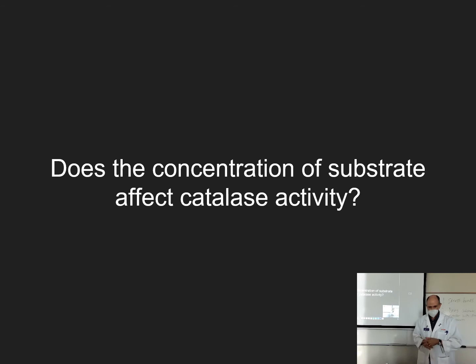So the question today is, does the concentration of substrate affect catalase activity? And to be even more specific, as I said earlier, there's a more specific question, and maybe I should just change this slide, but I haven't yet. A more specific question on the top of page 38. Well, actually, no. Actually, I lied. The wording is the same on the top of page 38.